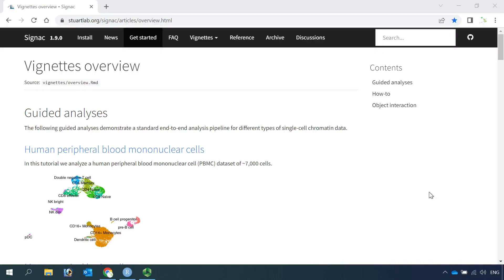Hi everyone, welcome back to my single-cell ATAC-seq video tutorials. In this video tutorial, I'm going to show you how to perform DNA sequence motif analysis.